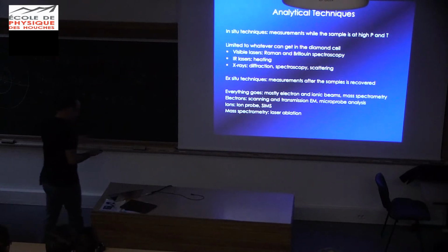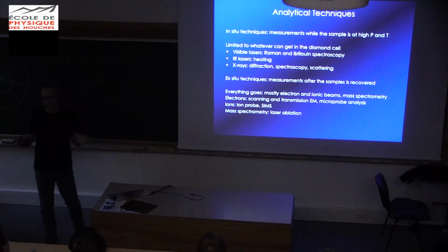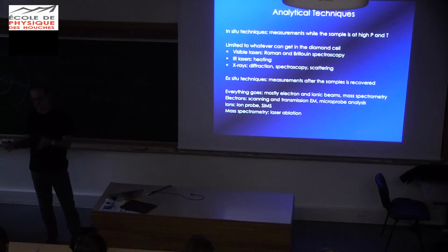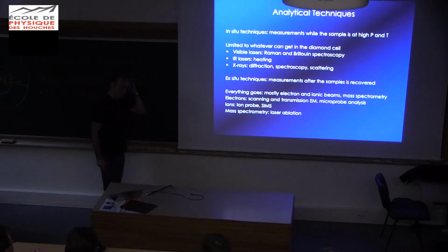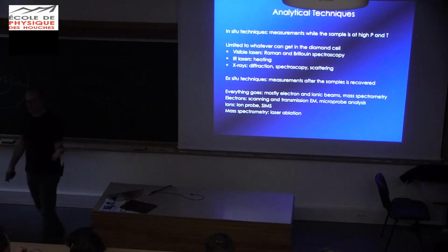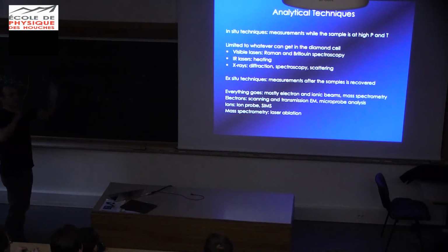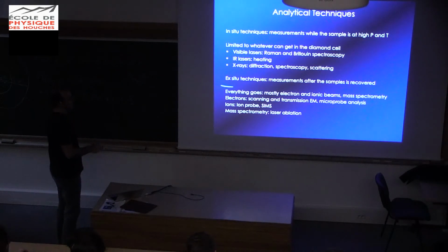So you've got your tools. They allow you to generate pressures and temperatures that are relevant for planetary interiors. Now, what layer you want to study, what part of the interior you want to study will tell you which press you need to use. But once you've got to that point, you have to do something. It's one thing to generate the pressures and temperatures on the materials that you're interested in, and it's another thing to be able to say something about what pressure and temperature does to them, right? So two big classes of techniques, analytical techniques, okay? You have the in situ techniques and the ex situ techniques.